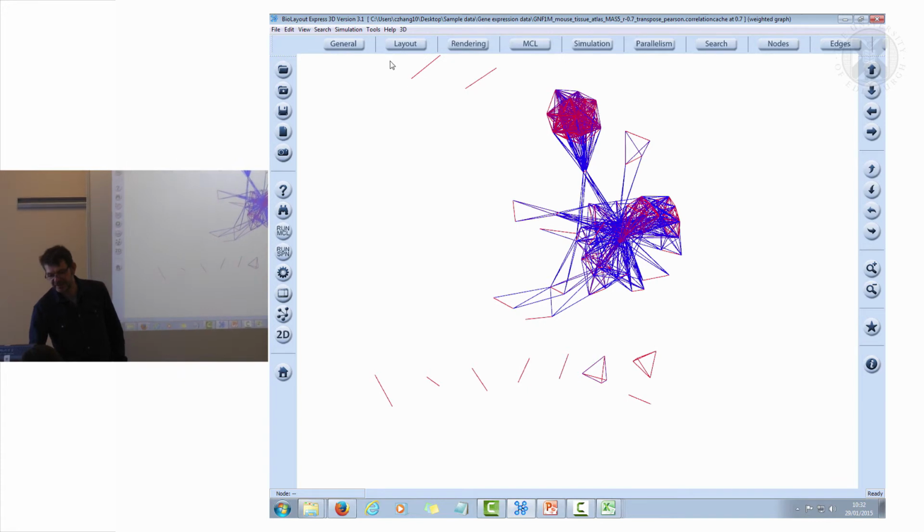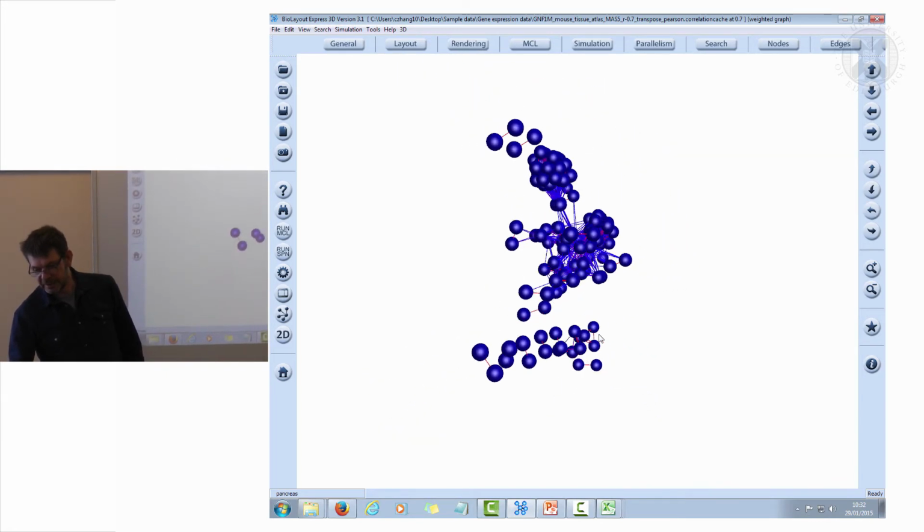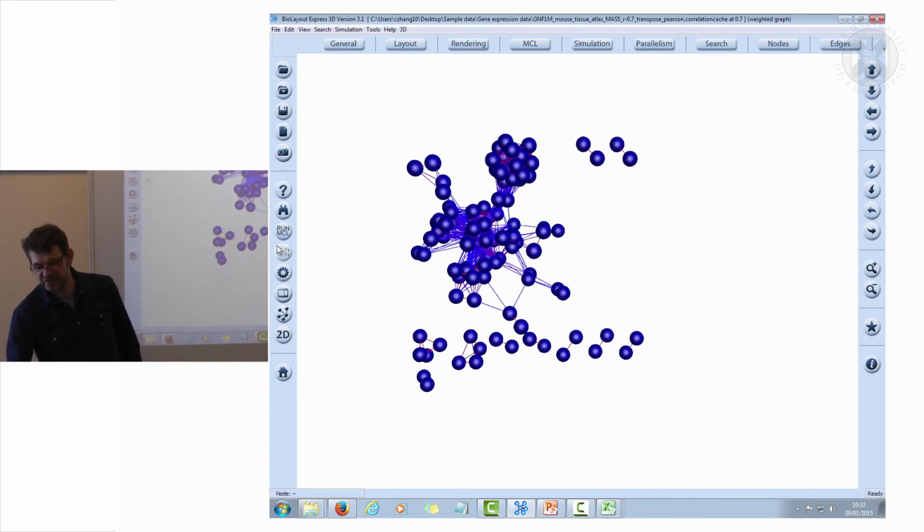So let me just go back to general, turn on my nodes again. Okay, so that is the structure that we want to exploit.